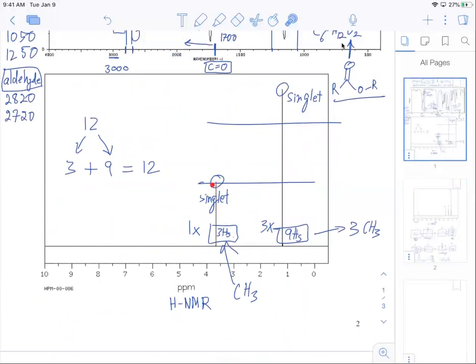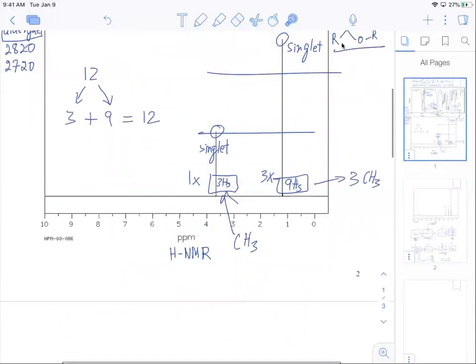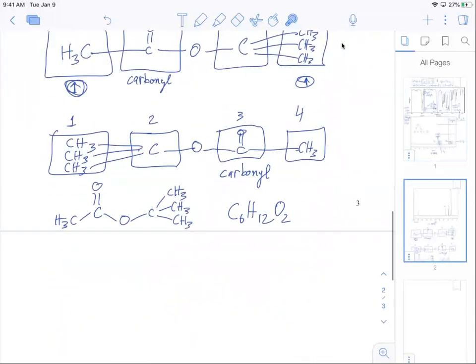Relative to one another. And if we go here we see that yeah there's roughly height of three whatever. And then there's roughly compared to that in context one, two, three, nine, a height of nine. So that would be the answer.